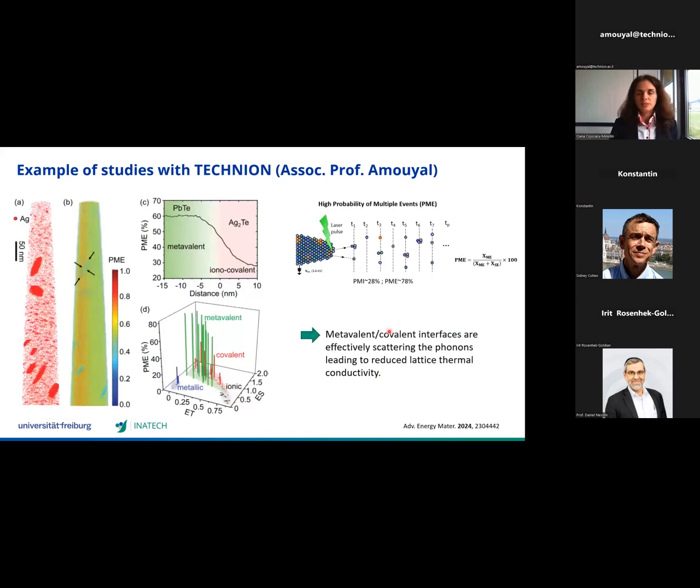Now, this is another very interesting aspect for the thermoelectrics, where it shows nicely the capability of the atom probe to probe bonding. So bond means the region between the atoms, right? We very often schematize that in chemistry with a small line, although in physics it is more like a cloud of electrons around two atoms.